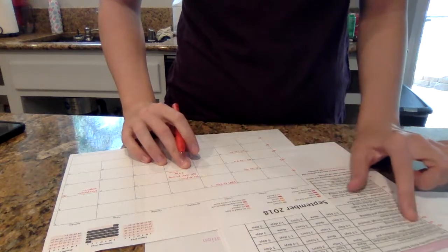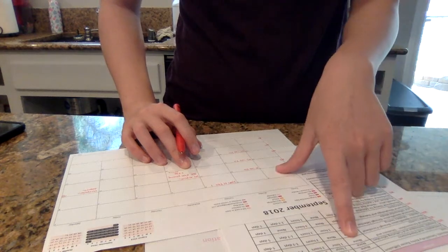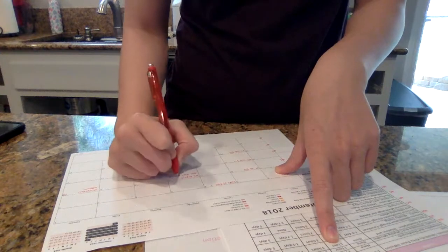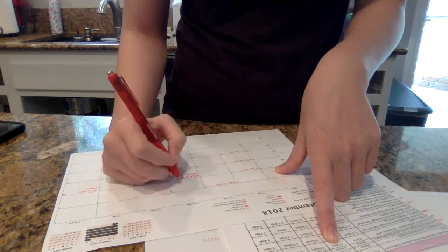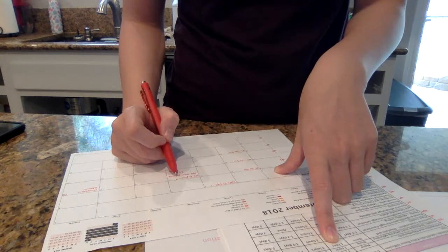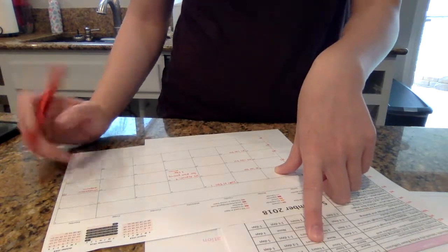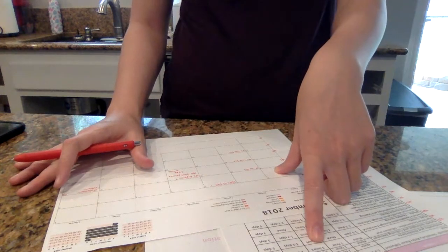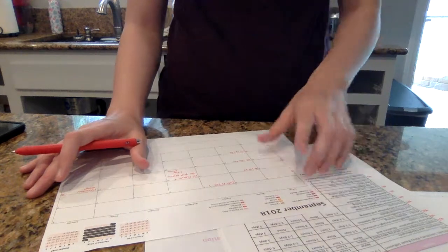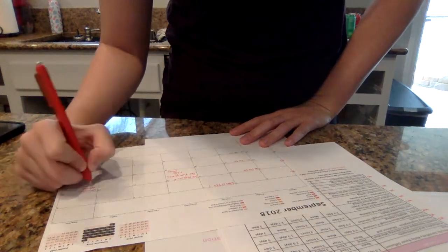Okay, and then the second lab is bacterial enumeration. There's no active culture. It's 1 hour plate pouring. So I can go ahead and take over plate pouring, and it's going to be 1 to 3 days. So this one follows about the same schedule as the other lab for that week.